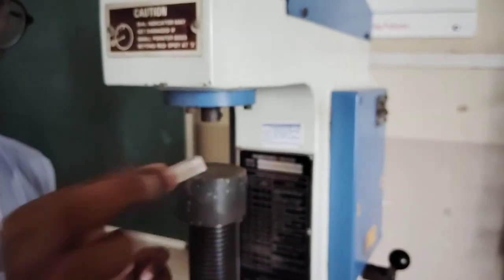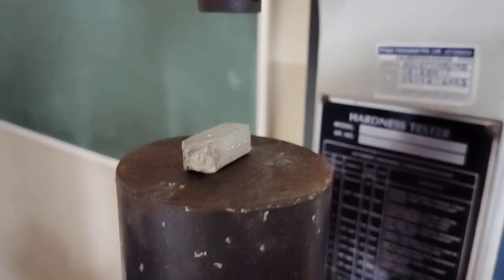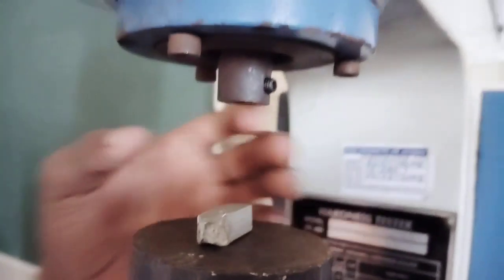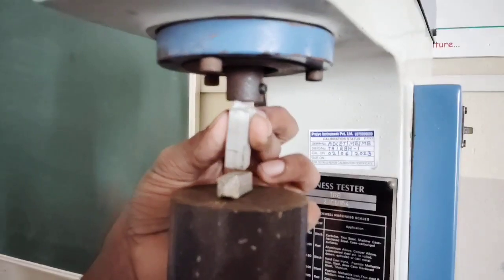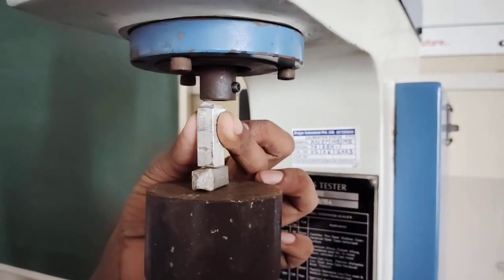So now I am placing my aluminium. This is an aluminium test piece. The indenter is not available now, but suppose an indenter is applied here, I will fix this indenter on one point.